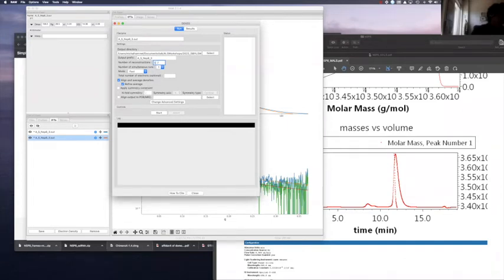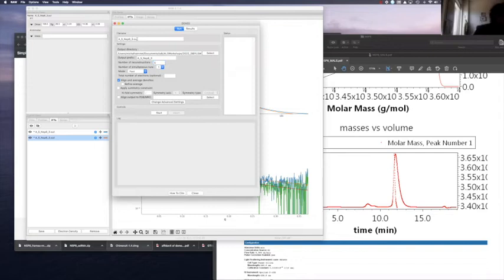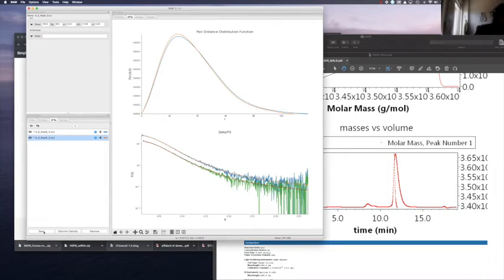I will keep just the 5 reconstructions running in fast mode, and I will not do refinement because it takes a little bit longer. I will use only one CPU, just in case you don't have multiple CPUs. Okay, now I will change this name. Sorry, I need to change the name here.